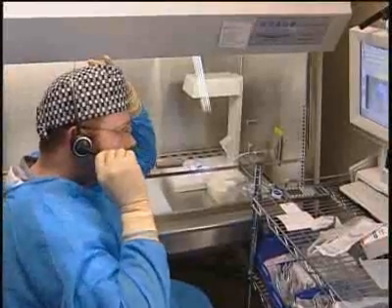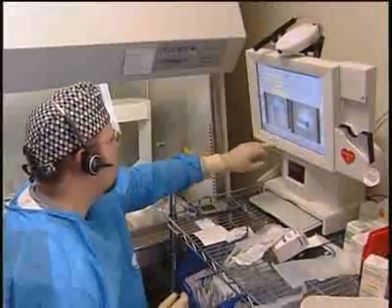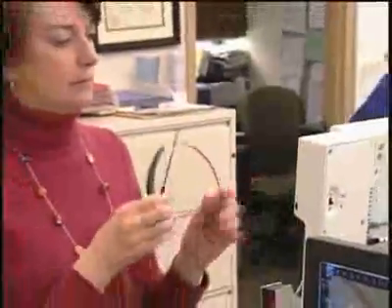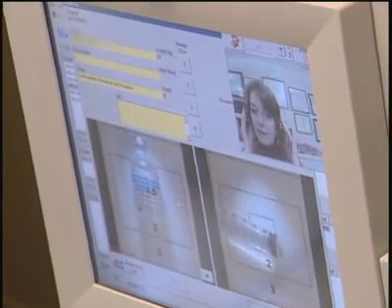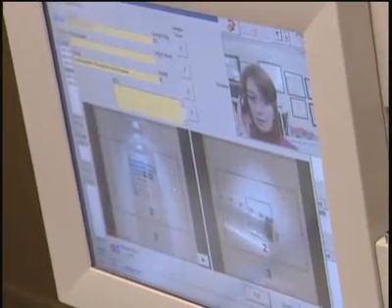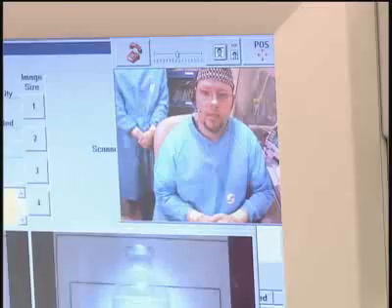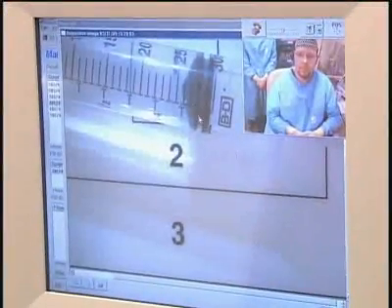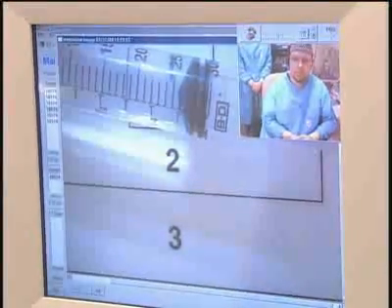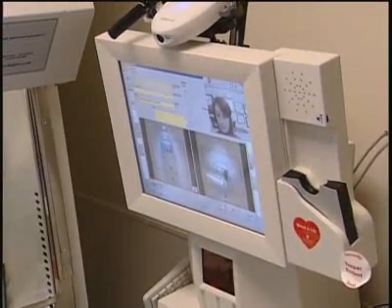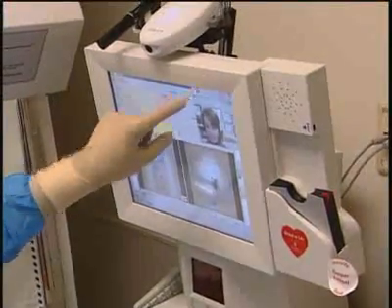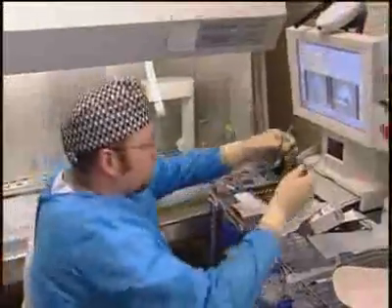Hi Debbie, this is Will. Would you like to verify that I have got the right volume drawn up in this syringe? I sure can — hold on just a moment. It looks good. Excellent, thank you. You're welcome. As you can see, the pharmacist verified that it is the right volume, so I am now cleared to inject it into the bag.